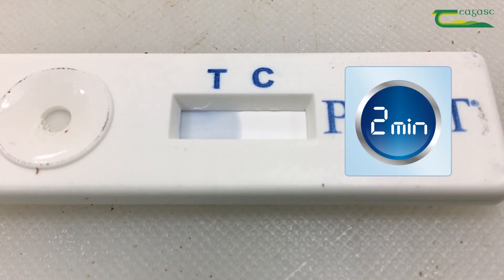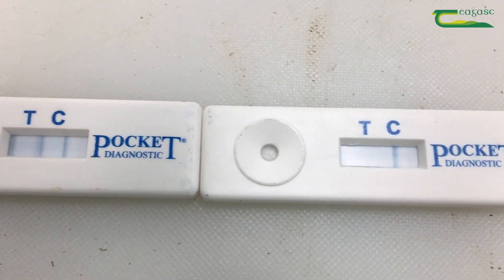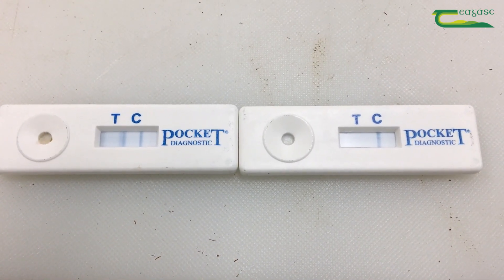Now wait two to three minutes to read your result. On the left is a positive result and on the right is a negative result.